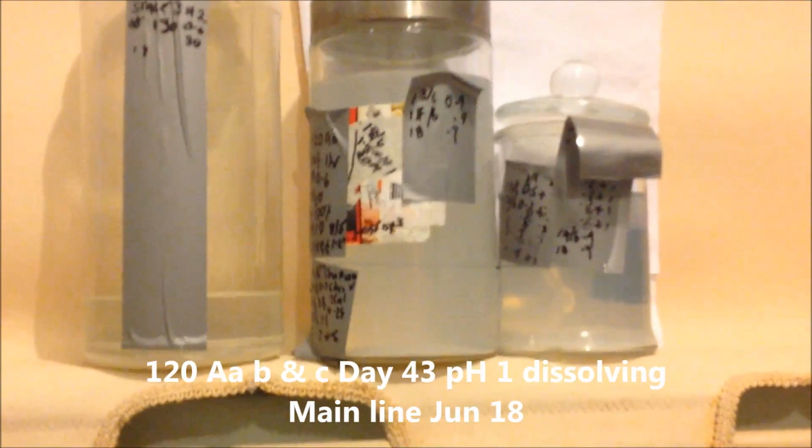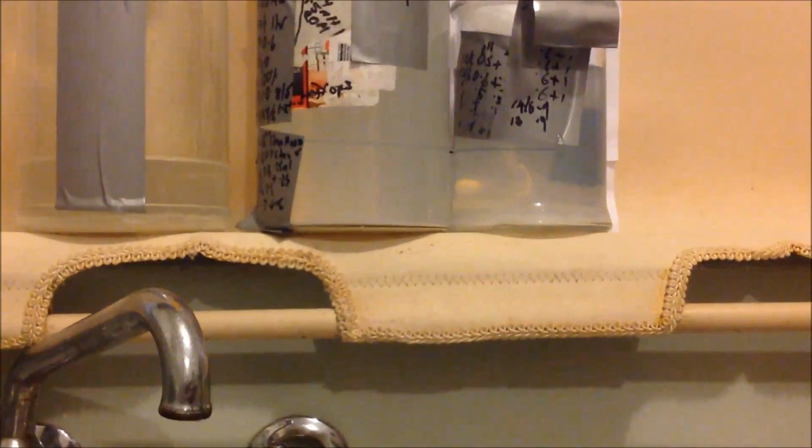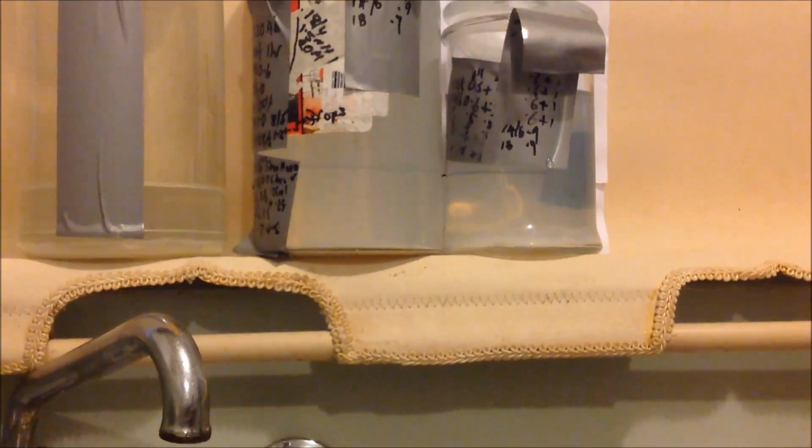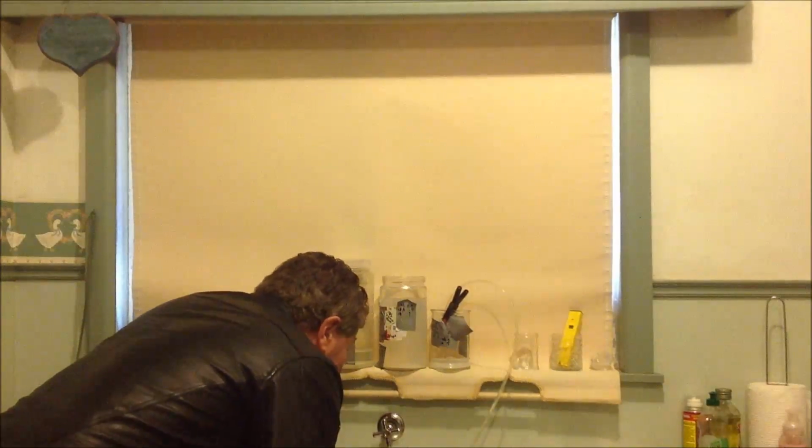120A, A, B and C, we're almost clear. I think I'm going to rack B and C off, and I'll probably put the lees onto pH 1 just out of interest, just to see what happens. Just like that, almost finished.